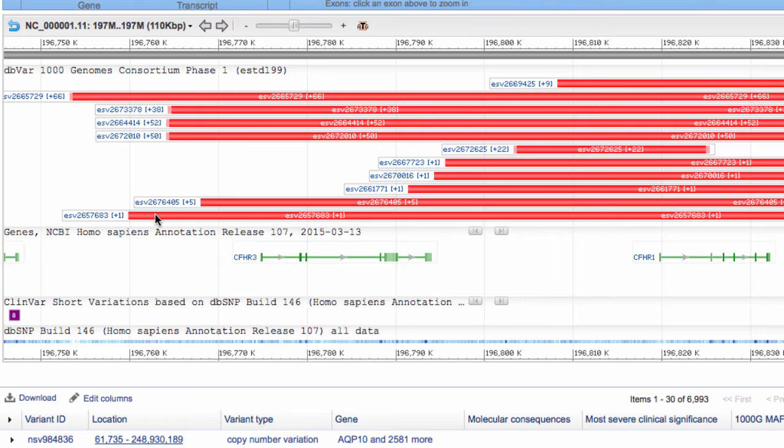For now, the maximum that can be displayed in the viewer is 500, however the mouse over tells you the total number of supporting calls.